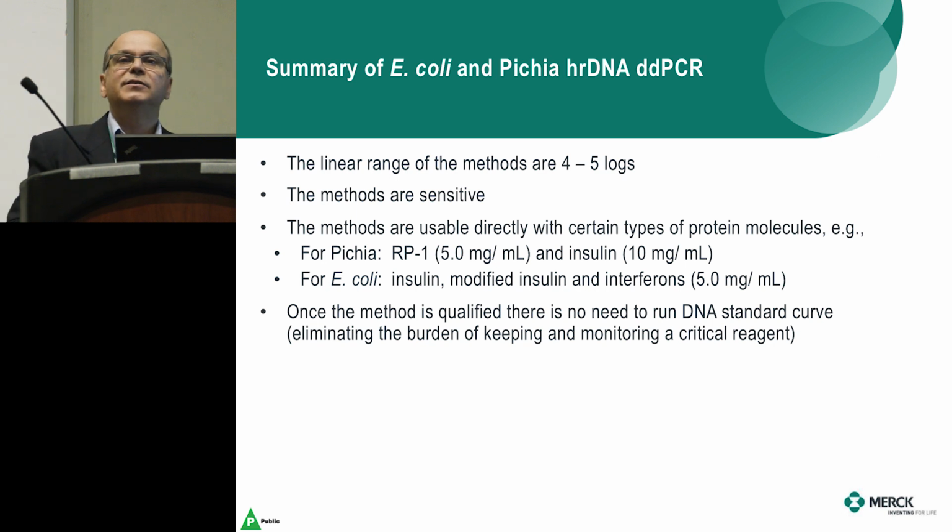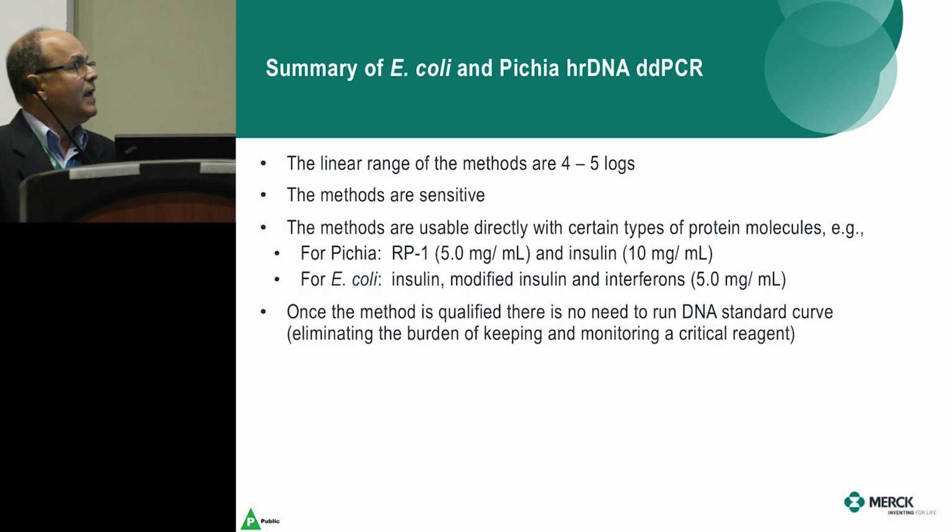So anybody who runs qPCR or residual DNA analysis tests, the one headache is to keep the DNA standard, which is an essential thing, and you have to store it and test it from time to time. With digital PCR, you no longer need to do that.